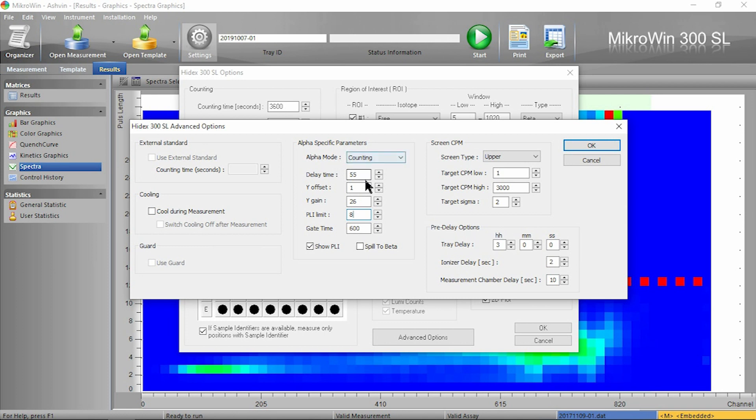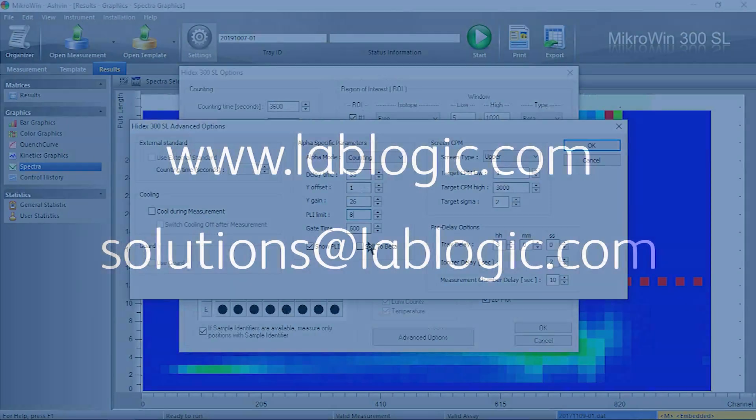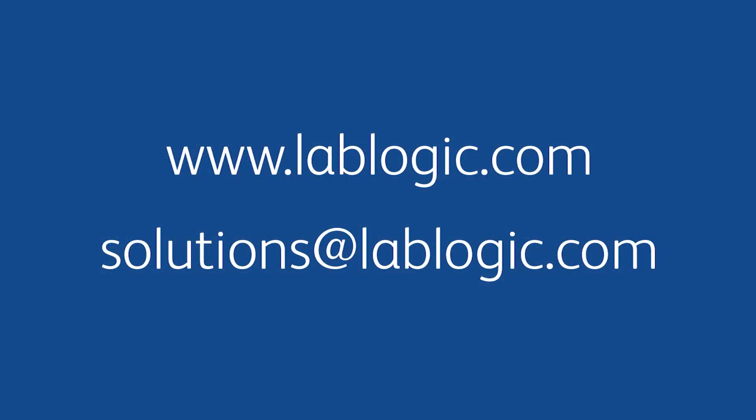These other settings here are factory default and should not be changed unless by a Labologic service engineer. For more information, please get in touch.